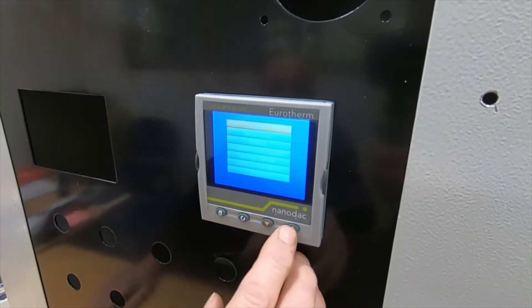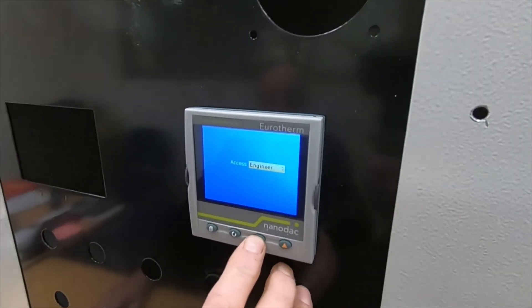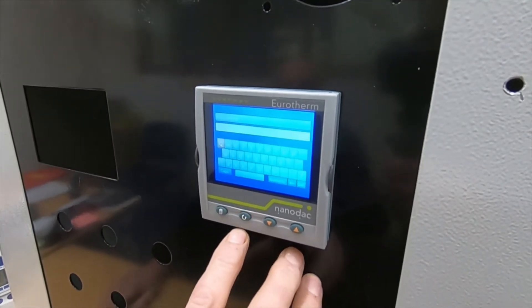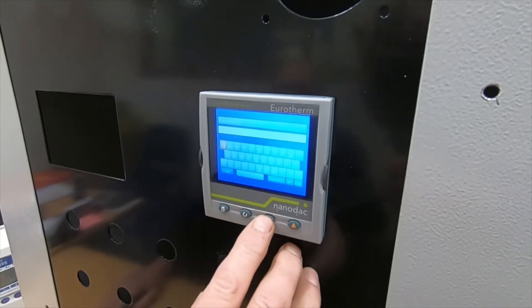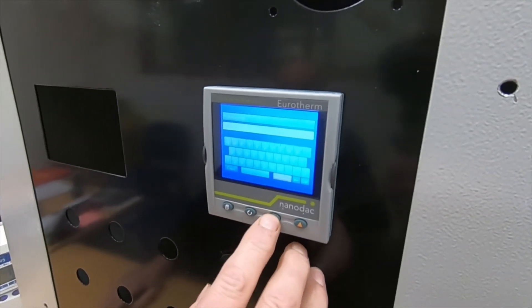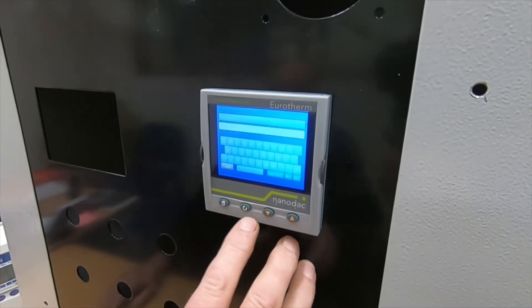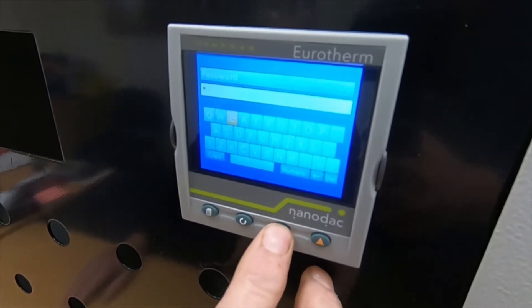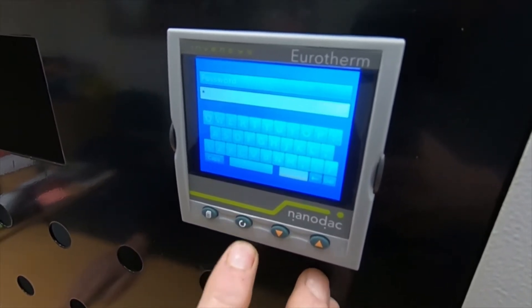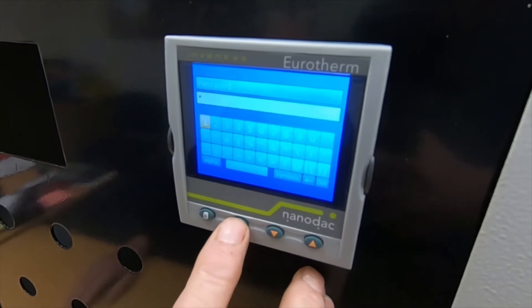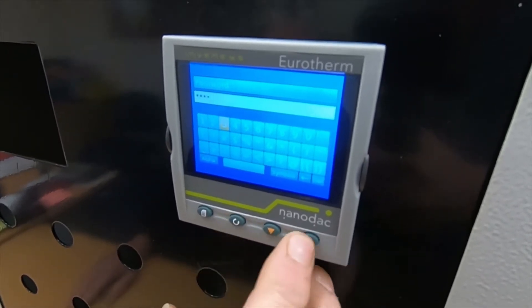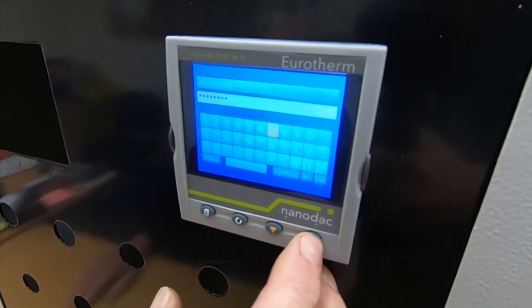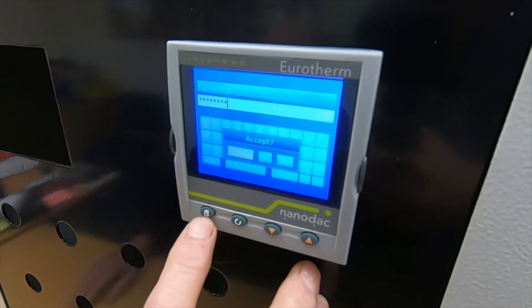For this instrument we put the correct password in. Select supervisor, then password. Now we have to select caps — capitals — and we're looking for E. Then the rest of the code is numeric: 1, 2, 3, 4, 5, 6, 7. Now we're into programming mode.